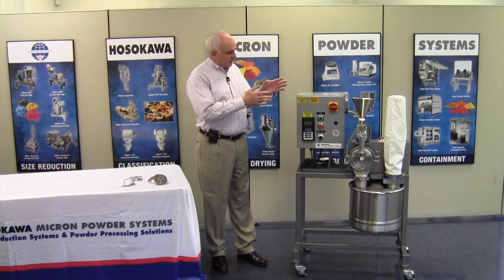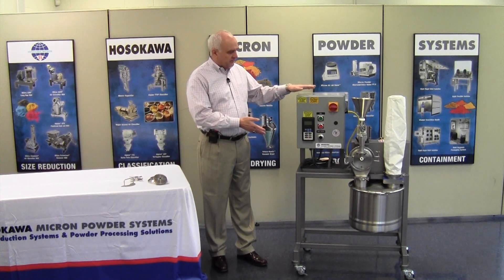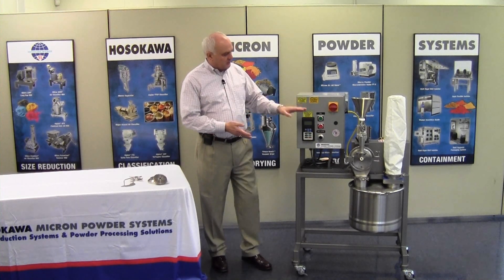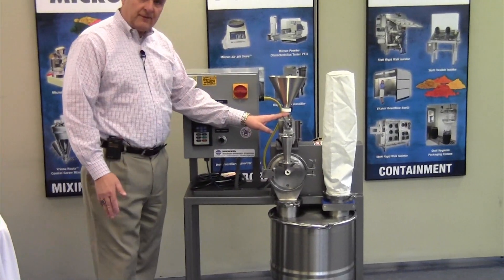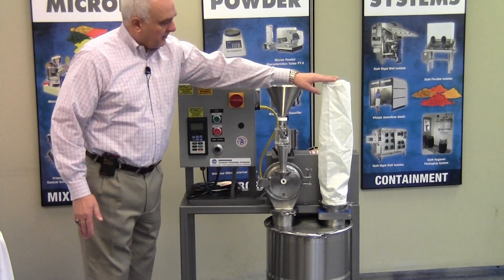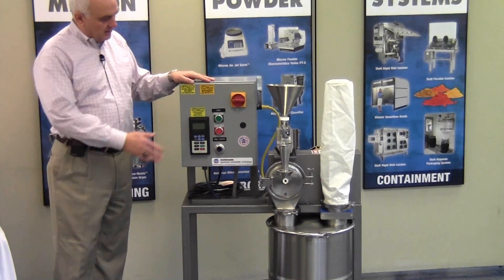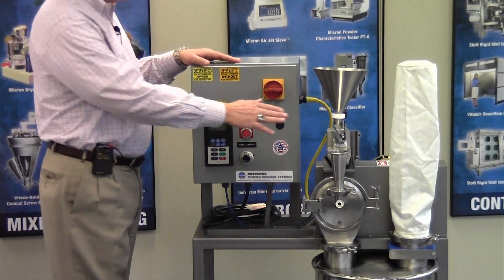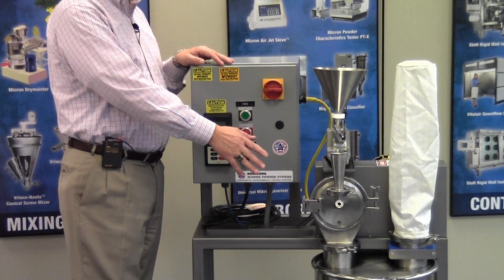I'm going to go through the UMP-B and what you see here in front of you. This particular model is a totally integrated system. It comes with the mill that you see here, as well as an integrated feeder, product collection chamber, air relief system, and control panel. The controls provide the capability to meter the feed into the mill and also control the speed of the mill to control final particle size.